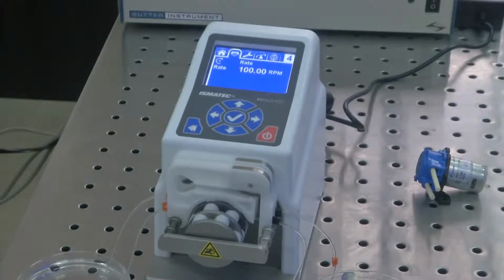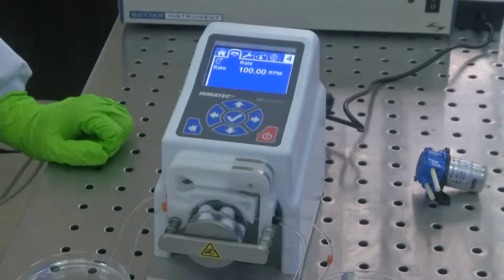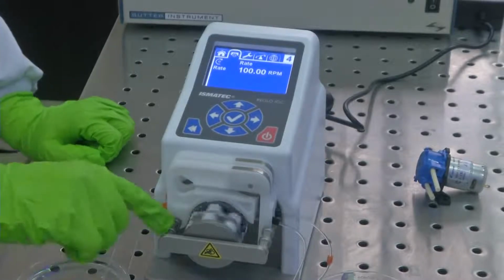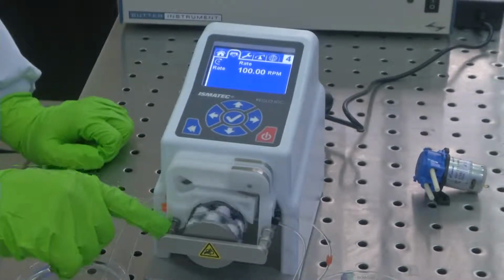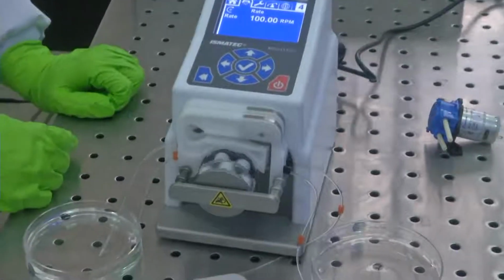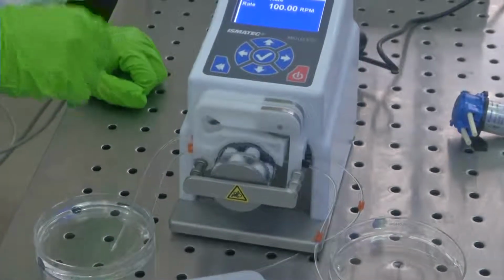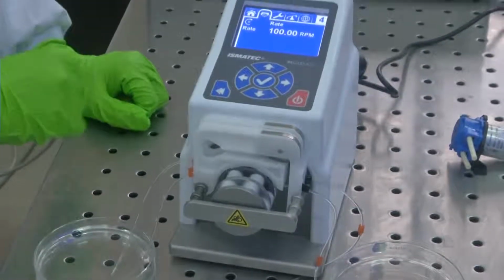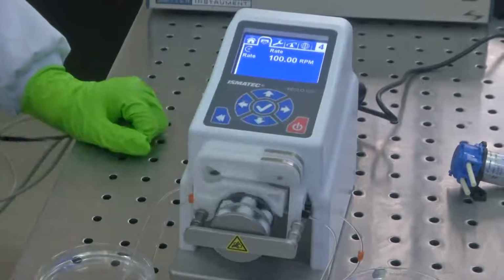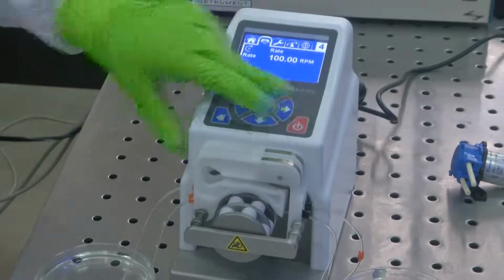Now let us run and see how the rollers rotate. As you can see, channel 3, cassette 3, is rotating anti-clockwise and the fourth one in the clockwise direction, and the relative change in speed can also be observed. As you can observe the variations, now let us see what other configurations we can do. So let us stop and then do the other configurations.